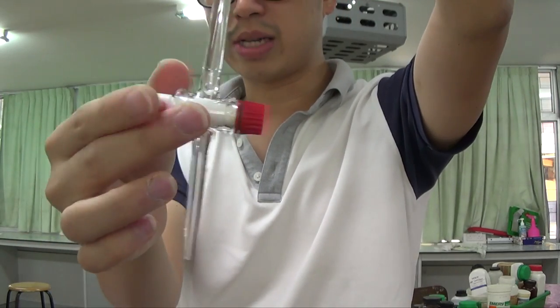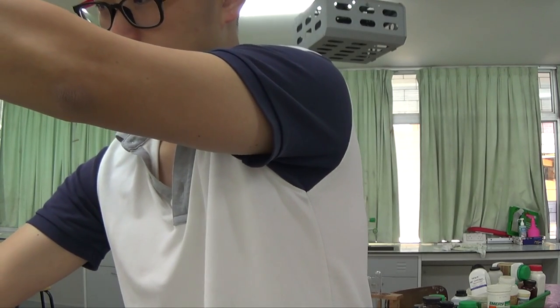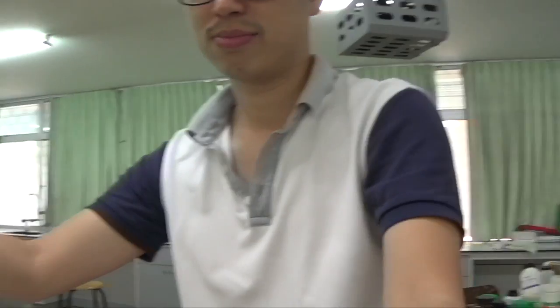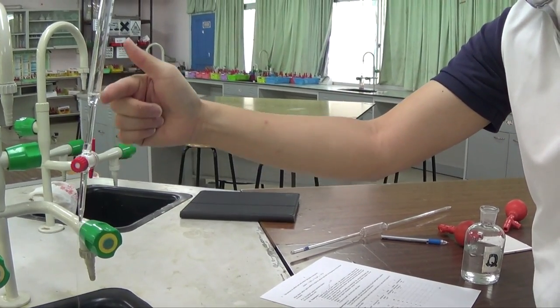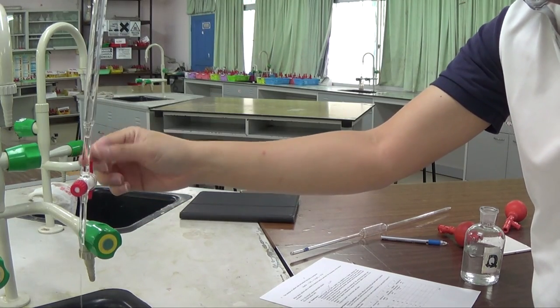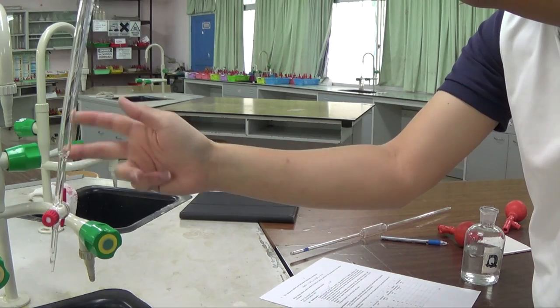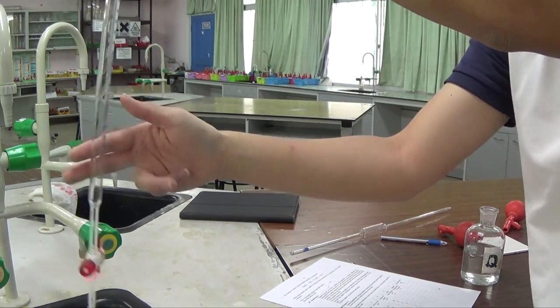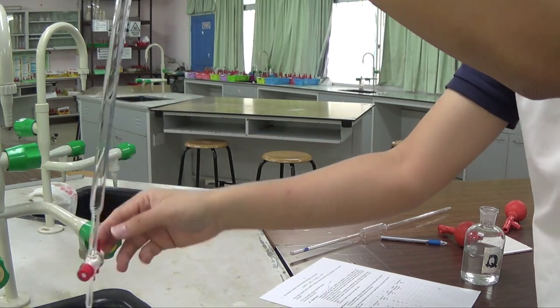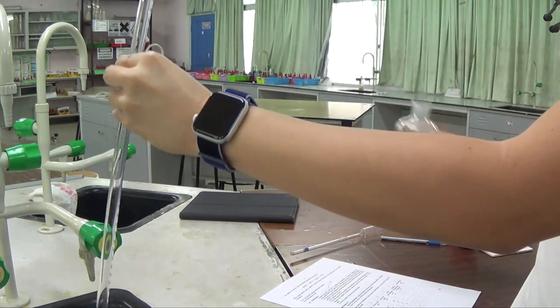So I will open the tap, but not to the ground. I'll open it into the sink. Okay, sorry, you don't really see this, but open it into the sink, making sure that the bottom bit is all rinsed through. So I don't want to keep that, because that is the rinsing. I don't combine my rinsing, which could be anything that was in the burette previously, not necessarily what we are filling it in with. We then close the tap, and then we fill it in.